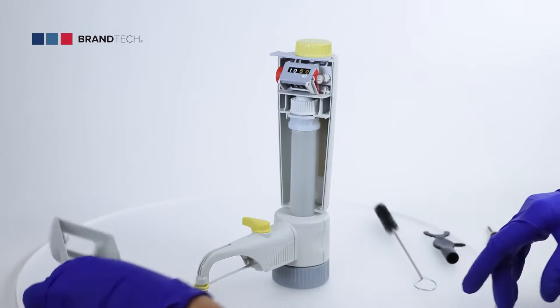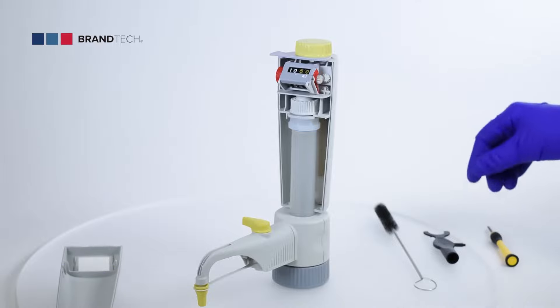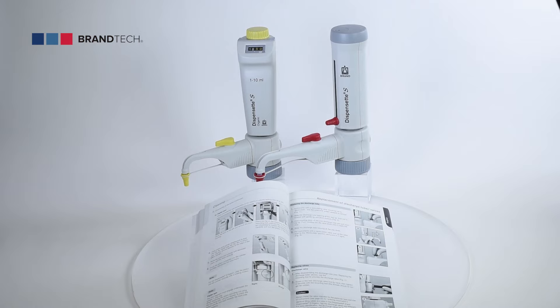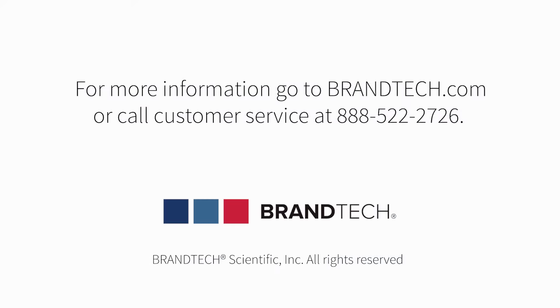The Dispenset S completely disassembles for cleaning. Cleaning instructions can be found in your operating manual. Refer to the operating manual for additional care and maintenance instructions to ensure that your dispenser stays in proper working order.